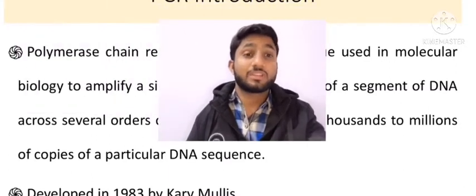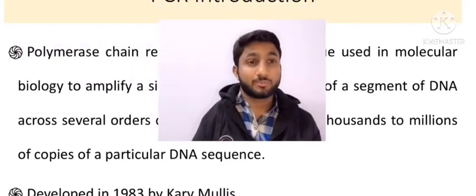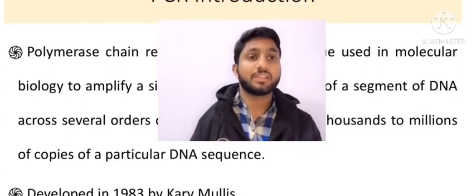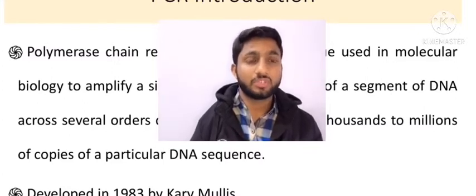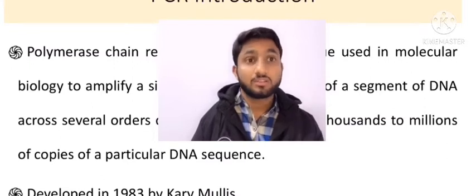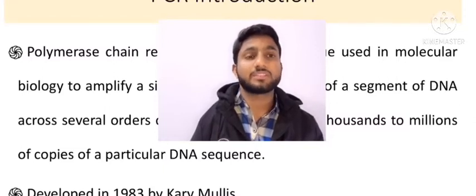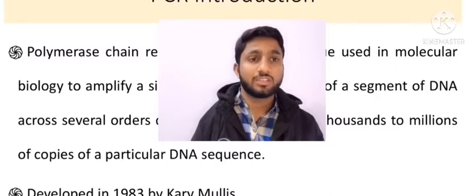Okay, students, first we need to understand what polymerase chain reaction is. Suppose you have extracted DNA, as we discussed in our previous videos, from bodily samples. We have discussed what kind of protocols we can follow and how we can extract DNA from bodily samples. You can see that in other videos on my YouTube channel.